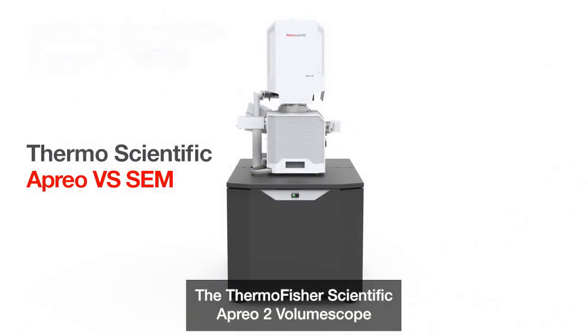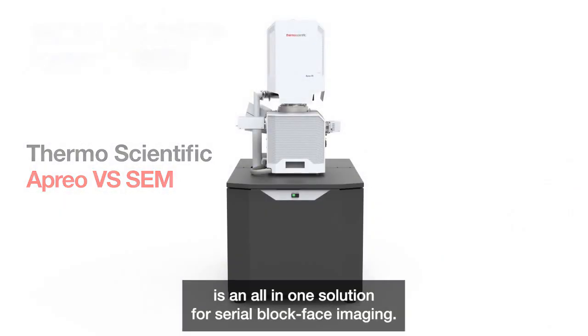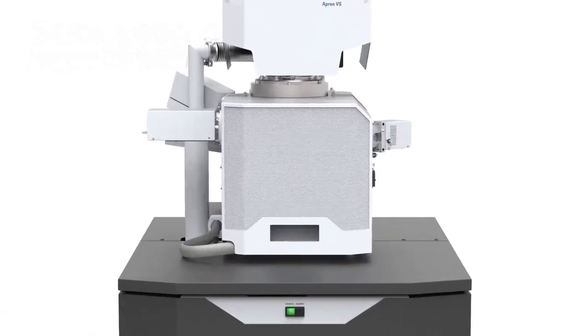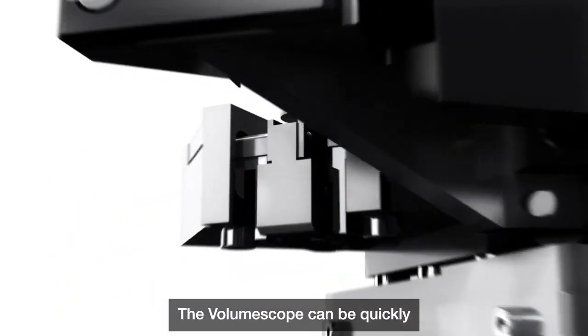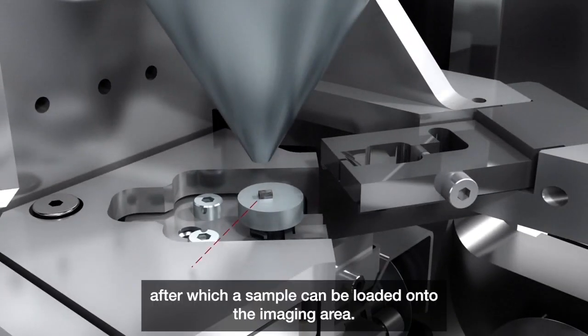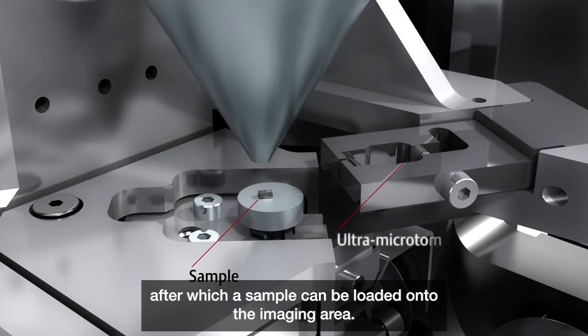The Thermo Fisher Scientific Aprio II Volume Scope is an all-in-one solution for Serial Block-Face Imaging. The Volume Scope can be quickly mounted on the stage inside the microscope, after which a sample can be loaded onto the imaging area.